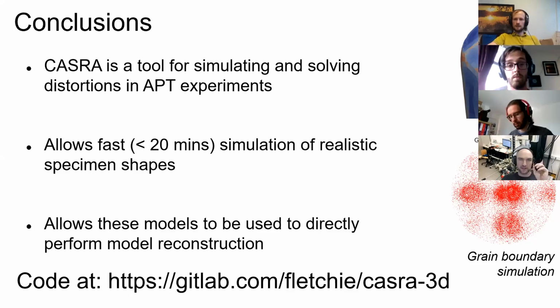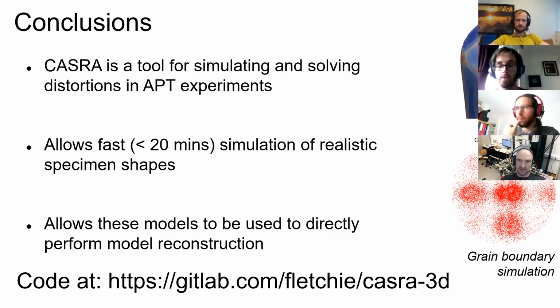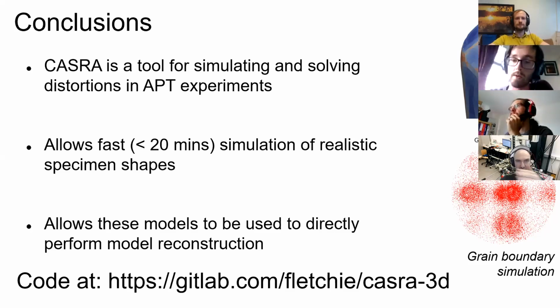Can I have a question? Yeah, Peter. A lot of the level set method would depend on the quantization of the surface, essentially directly on a triangulation. So how do you make sure that a triangulation is fit for an accurate representation of the field distribution on the surface? Because I can see you have some adaptive meshing here, right? At the shank, it's a little bit coarser.